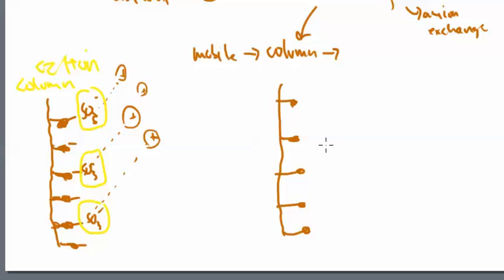So instead of SO3, typically this is going to be a nitrogen-containing molecule, and this is kind of a quaternary ammonium in a way. So this N, and I'm just going to put CH2, parentheses CH3 3, and this whole thing carries a positive charge. You can draw that if you want, or I'm perfectly okay with you just doing this number.